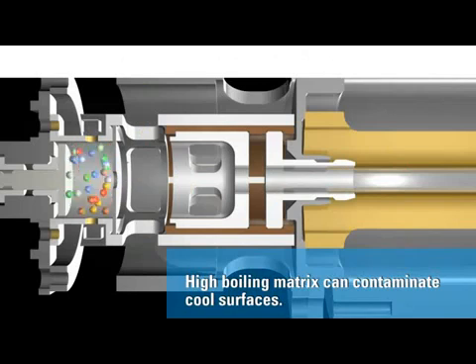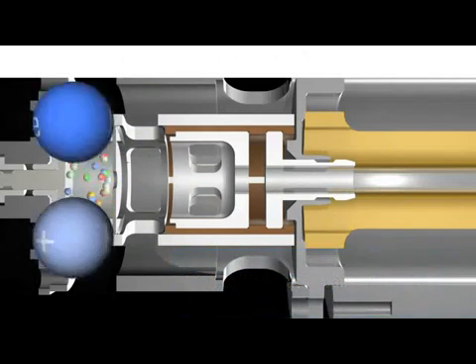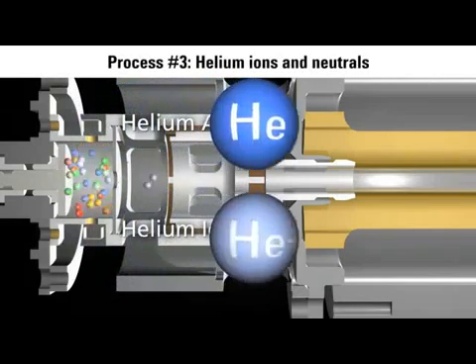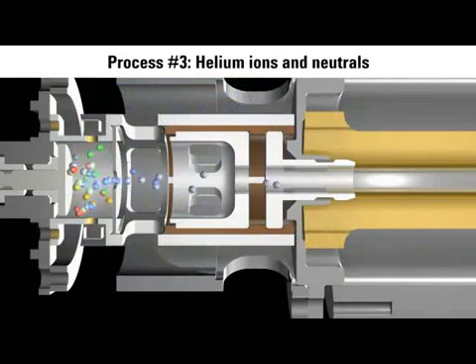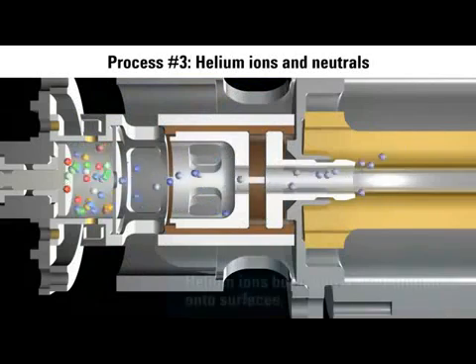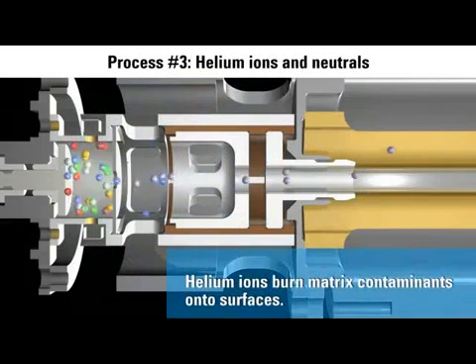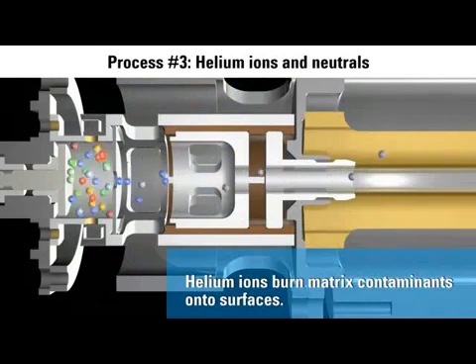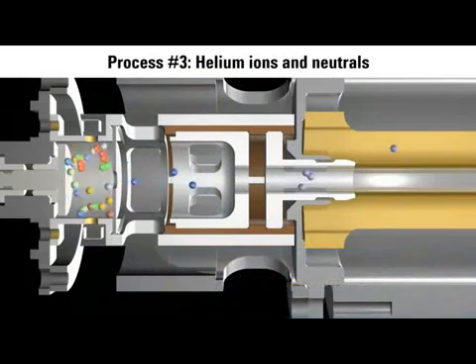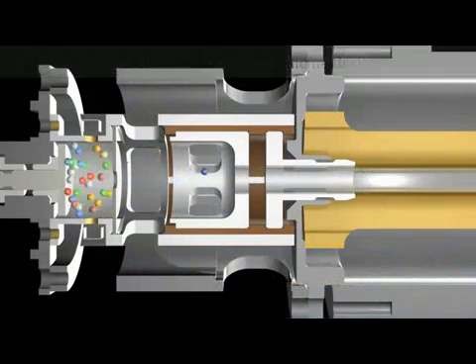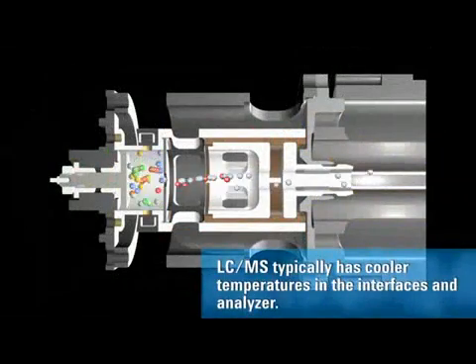A cool surface will accelerate this contamination process. As we think about the potential for contamination, we must not forget helium. The intense flux — high flow of helium ions — helps to burn the high-boiling molecules onto the surfaces of the source and the analyzer. The cooler the surfaces, the faster the rate of contamination, and the faster performance is lost.